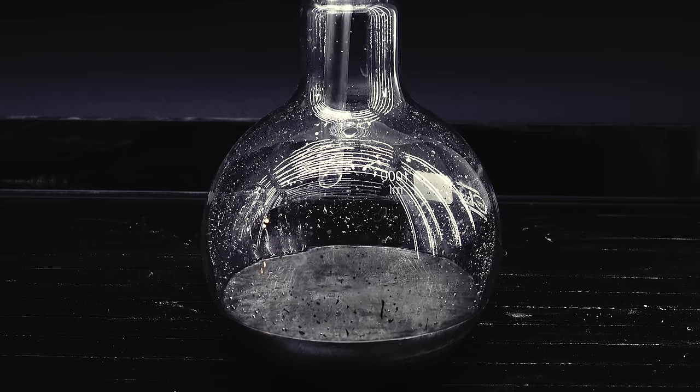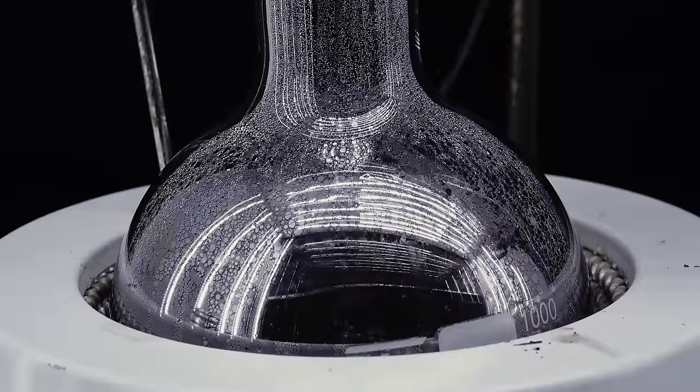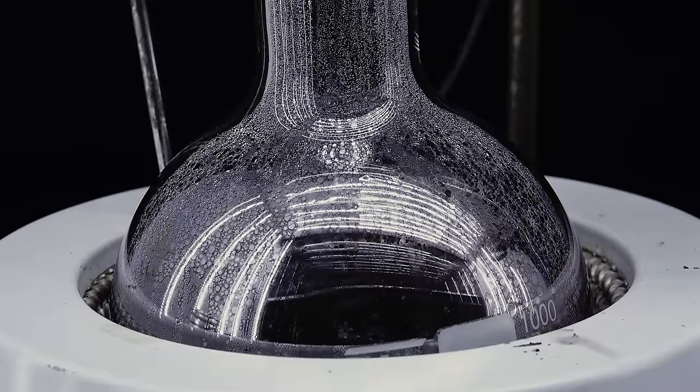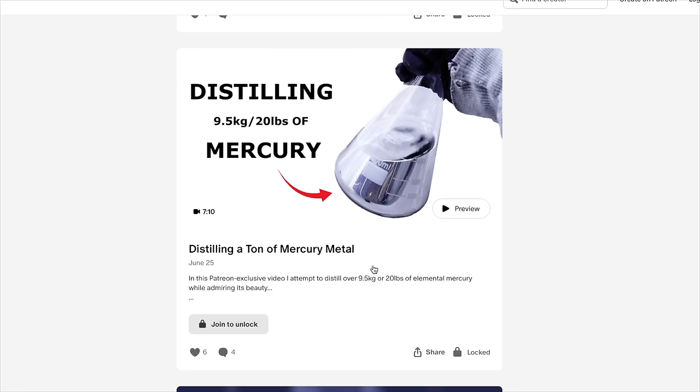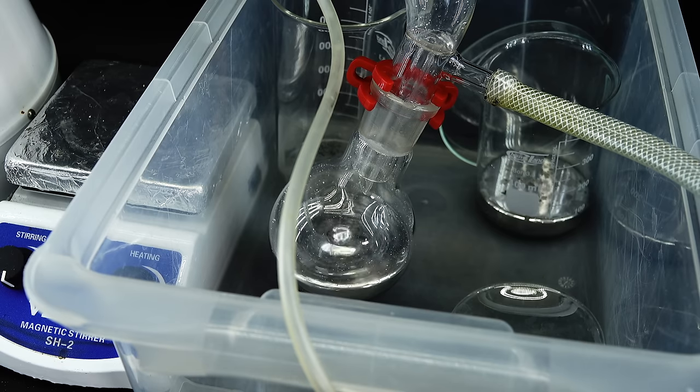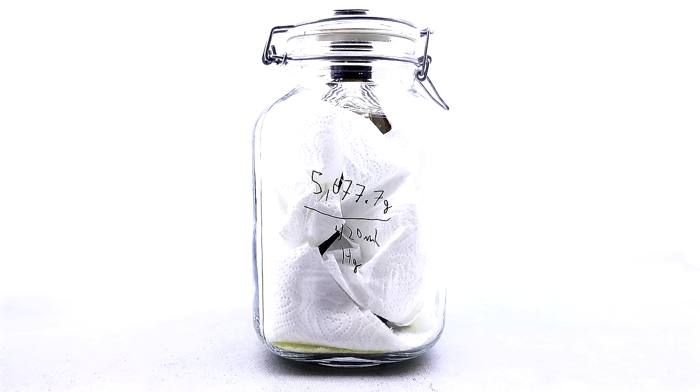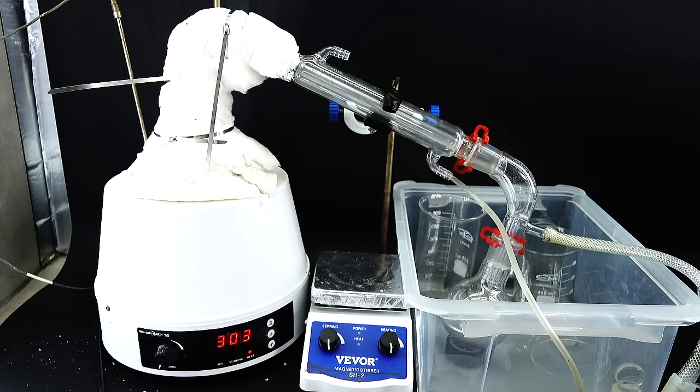Since it's dirty, meaning it has some unknown junk dissolved in it, I had to carry out the infamous distillation to clean it, and it went surprisingly well. For those interested, I made a video about it on my Patreon page. Anyway, I distilled the mercury into portions, the first of which I finished a few months ago, and put away for long-term storage, and the latter I doubly distilled quite recently, making it more than suitable for chemical experiments.